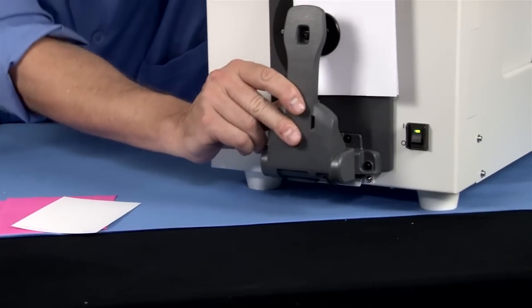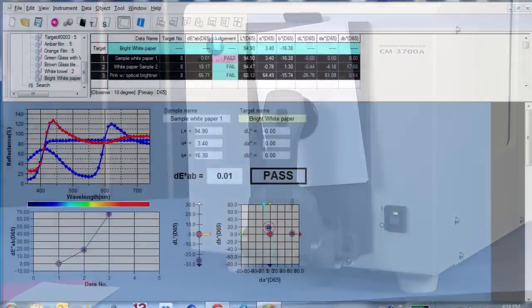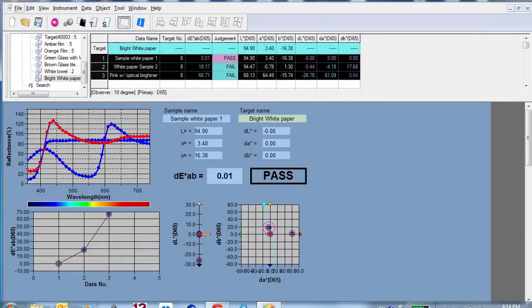The variable UV cut filter enables users to measure samples containing optical brighteners, such as paper, pulp and chemicals.